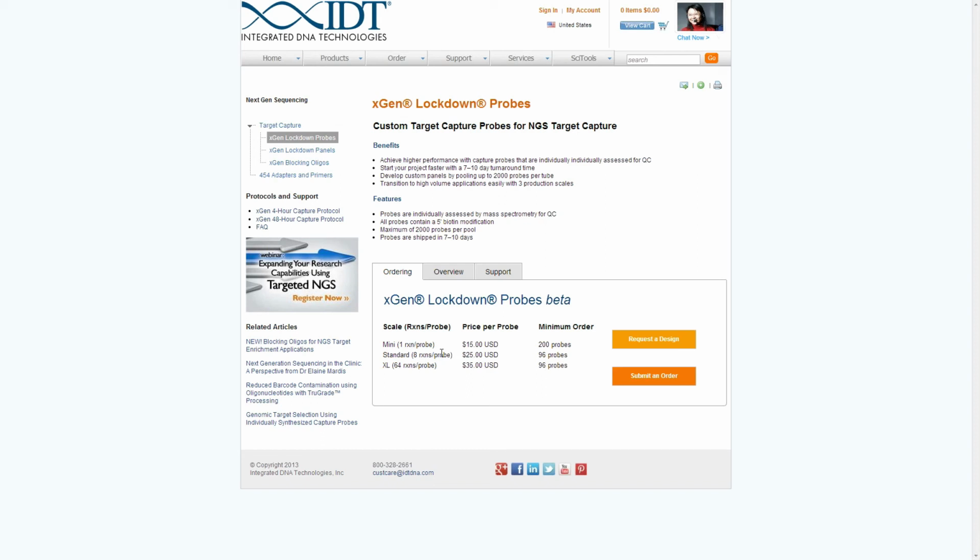We're starting to look into capturing larger fragments, but we don't have any solid data on sizes that large. I know we've done 600 or so bases, and I know we've gone slightly higher than that, but we haven't gone anywhere near 5 kb yet. But that is an application that we're looking into. Generally, it's for people who are doing longer type sequencing runs.